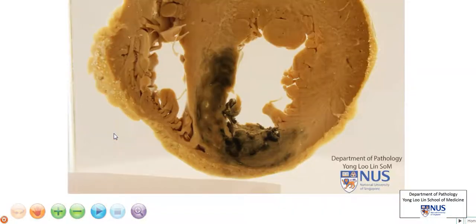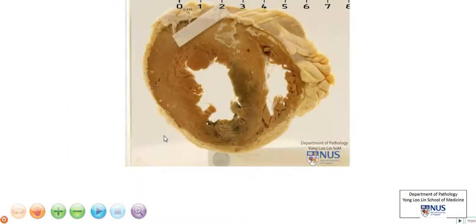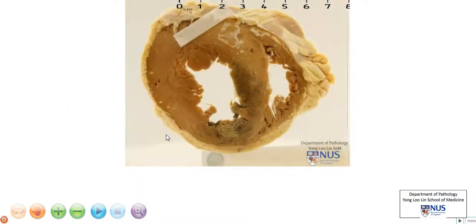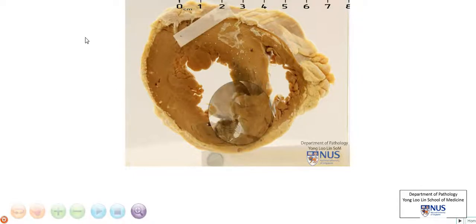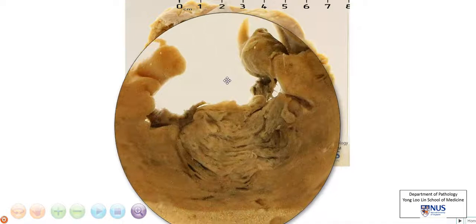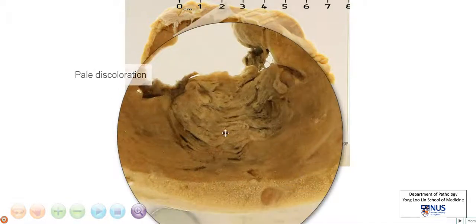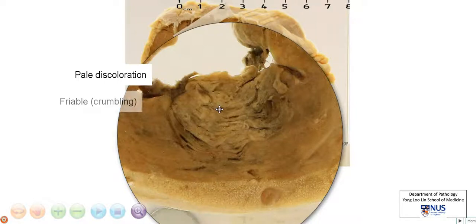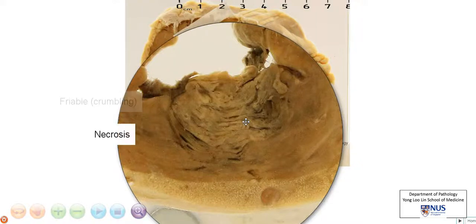So let's turn the specimen around and let's focus on this abnormal area. We can see that there is an area of pallor or pale discoloration. The tissue here grossly appears a little bit friable or crumbly, and this is the appearance of necrosis grossly.